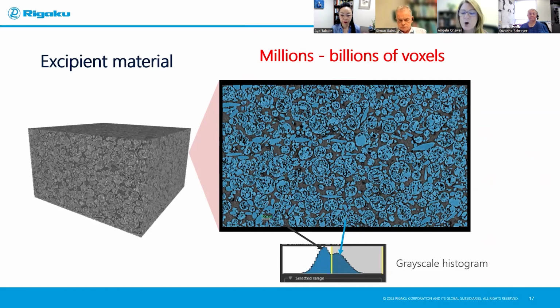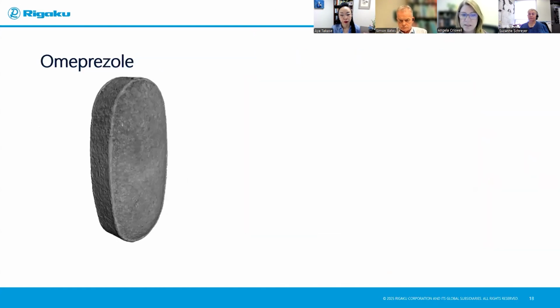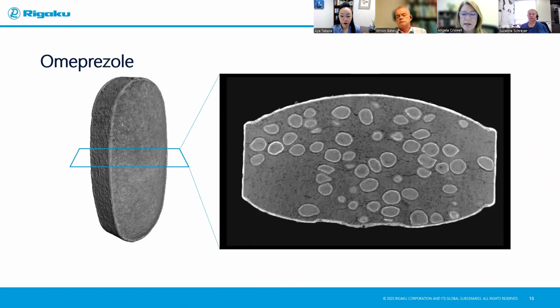But that doesn't always work. We have to resort to other tools. And how do we do that? So here's an omeprazole tablet, 3D volume data. If we cut through and look at a slice of this, we see something much more complex.